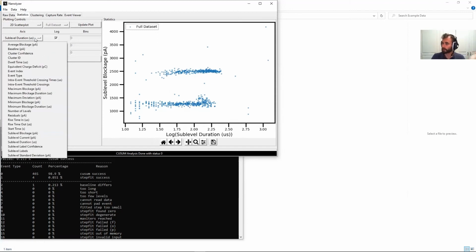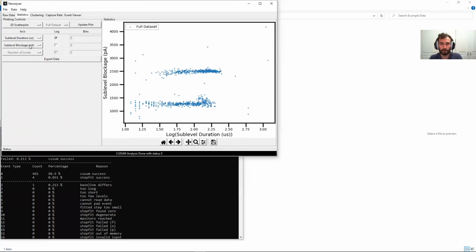As I said before, there's a link in the video description below which goes into detail about what every single one of these metadata columns actually means. I encourage you to just play with this. You're not going to break anything.